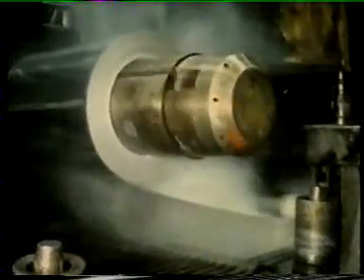Let's find out what effect the cold working has on the grain structure of the aluminium. Here we're etching a piece of the aluminium before cold working. At this stage, the grains are all approximately the same size and the same shape. Remember, they appear different shades only because of the way they reflect the light.